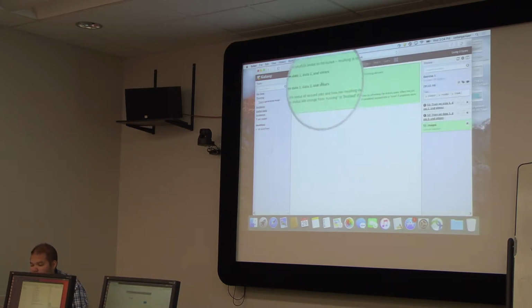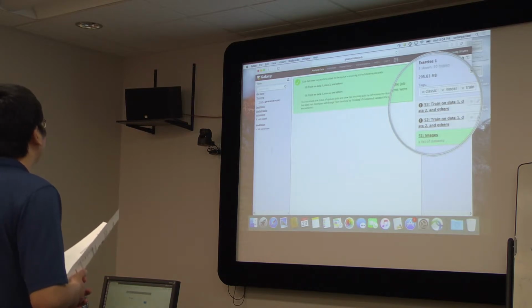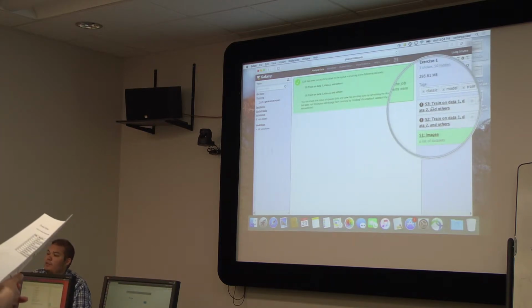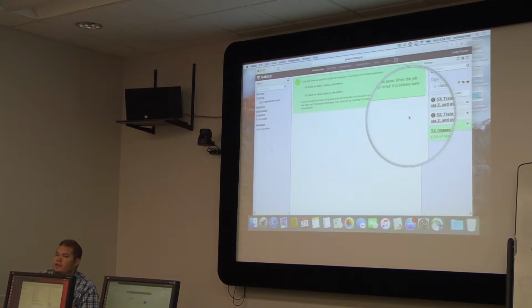And now, why do we have two jobs, 52 and 53? Two outputs, you mean? Yeah. Because one is the actual model file, and the other one is an HTML file that links all of the information generated by the training of the model. By clicking that little report, it will give you some information about the model. You will be able to download the option structure used to train this model. It will download the temporary folder, and another folder that contains all of the parameters that were extracted from each of the images.